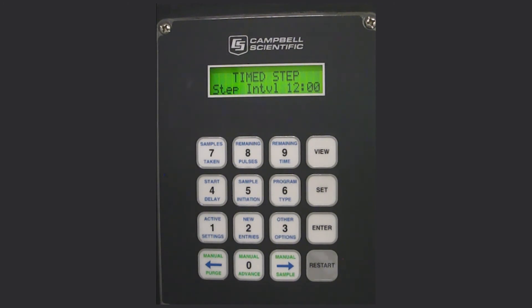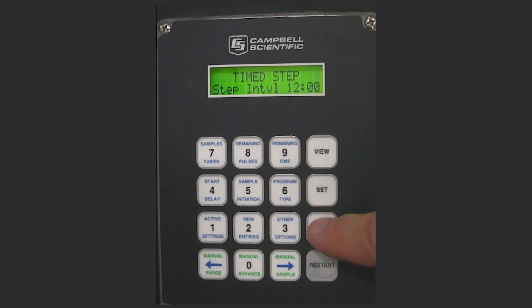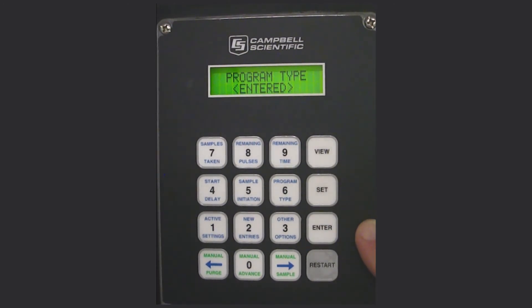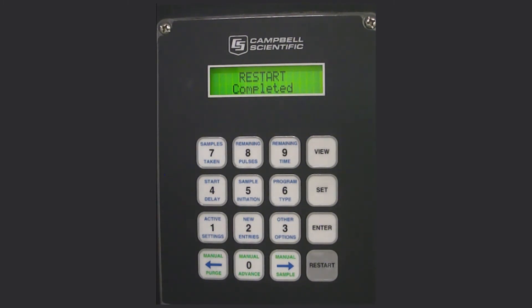Step interval is when you want this to happen. In this case it is set at 12 hours. You could change that to every 24 hours, every one hour, or whatever interval you want for switching back and forth. With that completed, press enter. Then press restart two times. When you press restart two times it will show completed and the sampler is ready to begin.